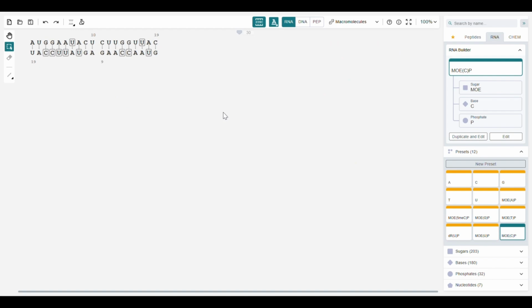I need to make one change to finish drawing patisiran. Both strands have a 3', 2DT nucleotides overhang. If I just type T from the keyboard, on the opposite strand, complementary nucleotides are added. In this case, I do not want that, so I will turn off sync mode. Now typing on one strand does not impact the other. Let's proceed to the second example.